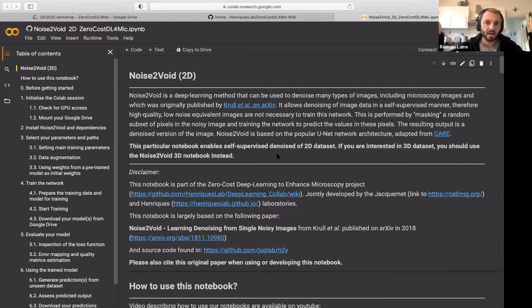And there we are. We're now entering the world of Google Colab. As Guillaume highlighted to you this morning, Colab will provide us with basically a little machine. What I mean by machine is a computer, essentially, that sits in the cloud, to which will be associated a little bit of memory, some computational power, and importantly, a high-end GPU to be able to do all of this.